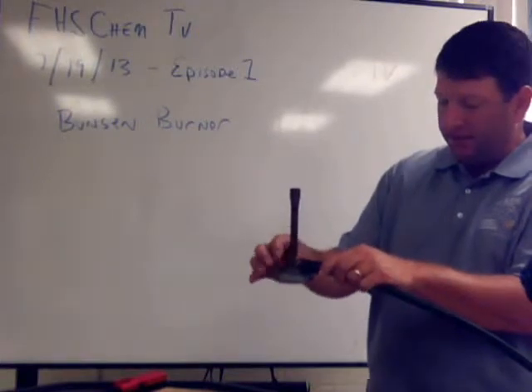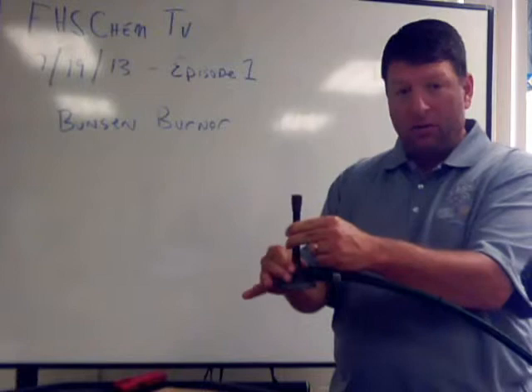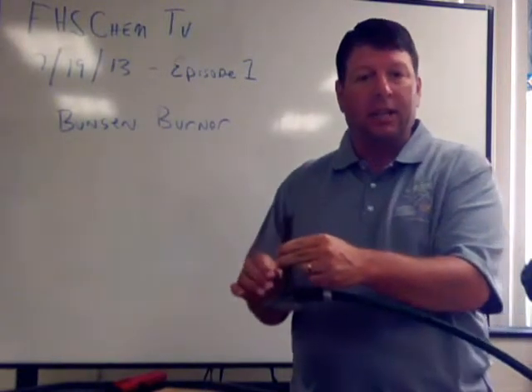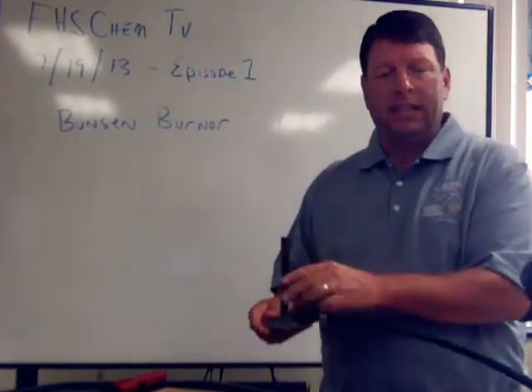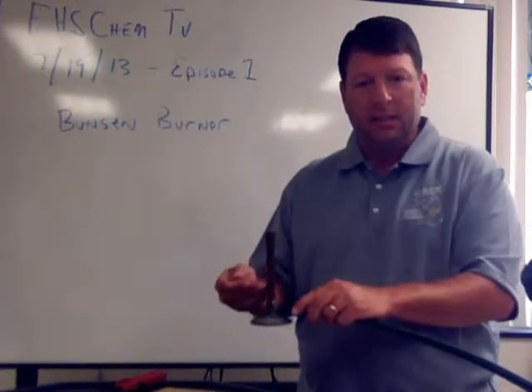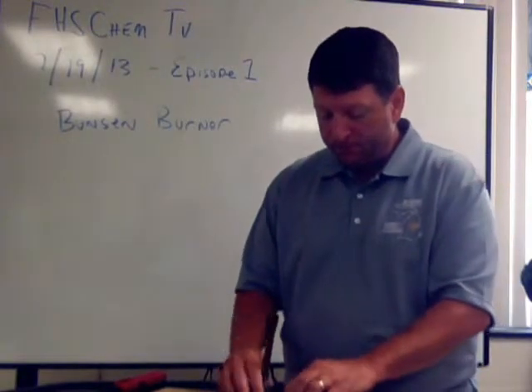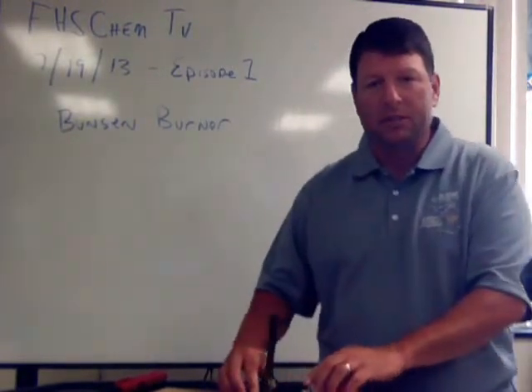The second part that we want to show you is the air intake valve. That valve is right here — this valve rotates to allow air to enter in and change the flame. This is the barrel of the Bunsen burner, and then, of course, this is the base.